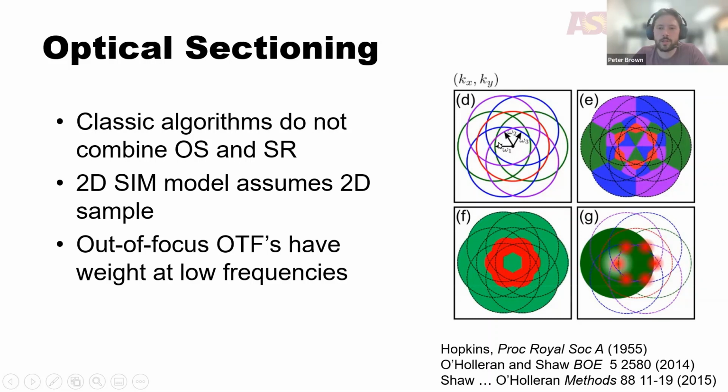So if we attenuate the signal in our unshifted band computationally and replace that with our shifted band, then we've got rid of a lot of this out of focus light. And similarly, we should do this in the higher band, in the first band, but here at its shifted center.